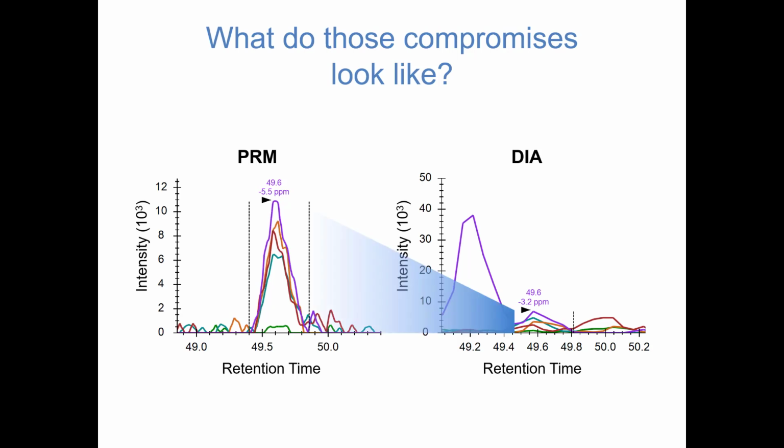But one thing that I think is actually kind of interesting is the amount of signal that you're seeing down here is actually reflective of the amount of signal you're seeing here, right? So this is 10 times 10 to the third, and this is 10 times 10 to the third too, right? So this actually is the same kind of data that we're measuring. It's just maybe slightly lower fidelity, and there are other peptides here at the same time that cause interference in these measurements.